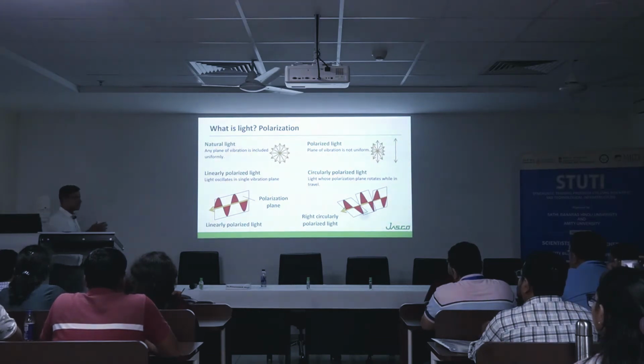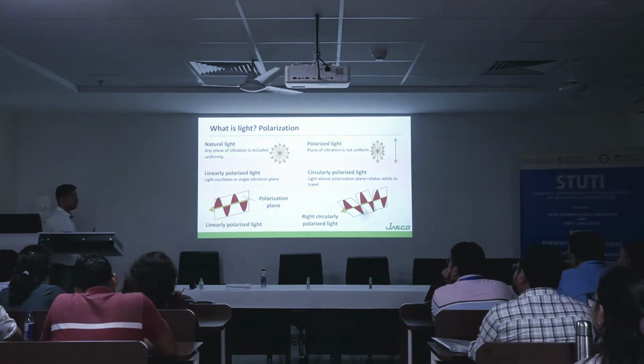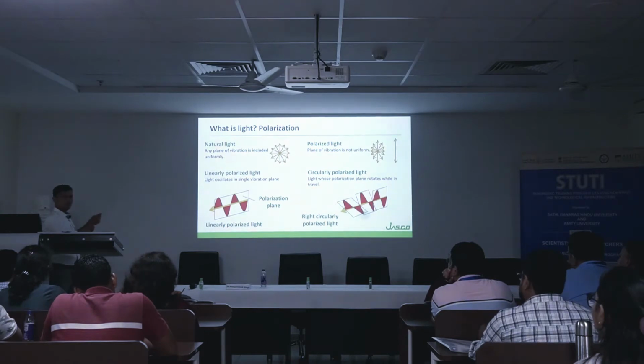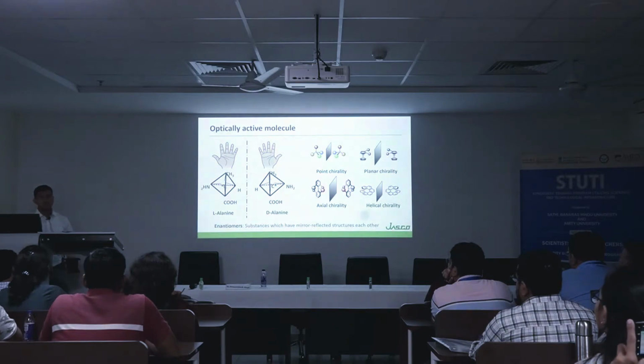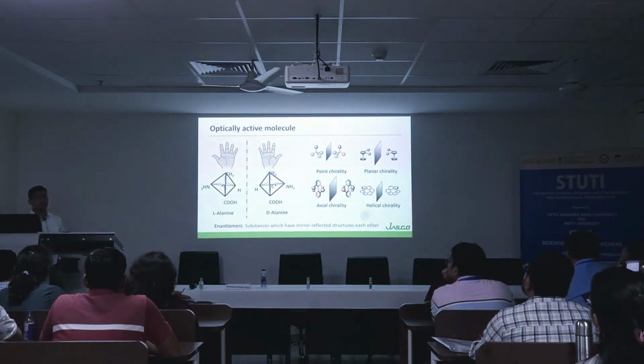Firstly, we are going to work in the UV-visible and near-IR region with the circular dichroism instrument. This works on optically active molecules. If your molecules are optically active, then you can analyze your samples very well. It includes proteins, peptides, even natural compounds. To a certain extent you won't get absolute chirality, but you will get something.